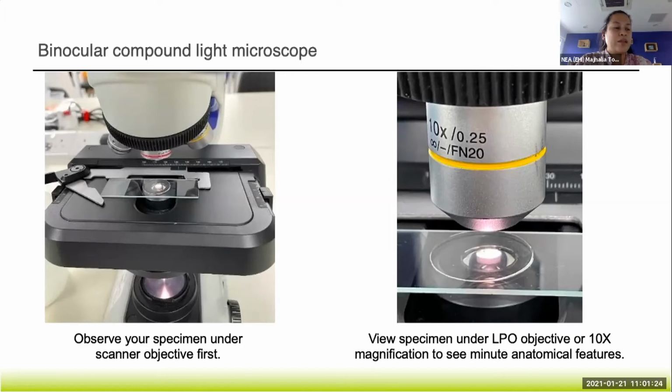We always collect 3 of each. And then, of course, the different stages. If you have pupa, also check the pupa. If there is pupa, check all pupa. If there is larvae, then you can check 3 samples of the different kinds that you see. So there may be a combination. We've encountered combinations of 3 different species in one sample, and there are just 3 samples inside.